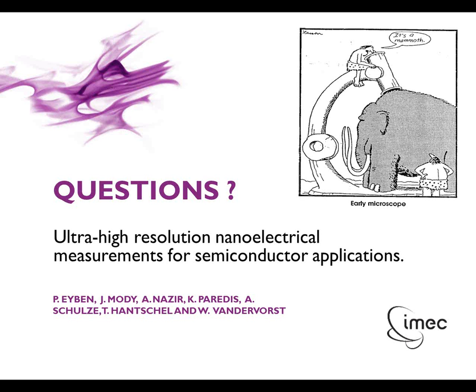If you look back at the images that I presented today, you will see some where we can see the gate oxides, or very small features present in the image. So in reality, we can reach a resolution of around 1 nanometer. That's sure. But not with all tips and not with all kinds of sample preparation. You need a very flat, nicely prepared sample, and you need to select a very sharp tip that you can use at a moderate force.